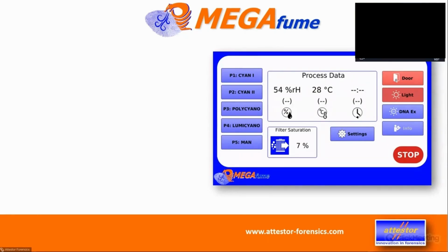Now, this is probably the biggest difference to what the systems at the time when we developed it did in the market. Everyone was just counting cycles. Now, what is a cycle? If I go to the equivalent system that you have in your lab, and go into the manual, it will probably say something like, this cabinet is good to be used with an amount of cyanoacrylate between 0.3 grams and 5 grams.